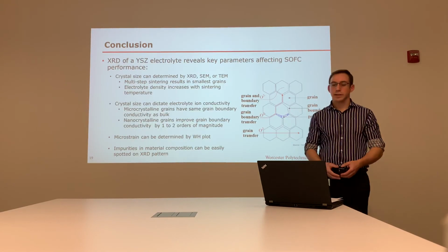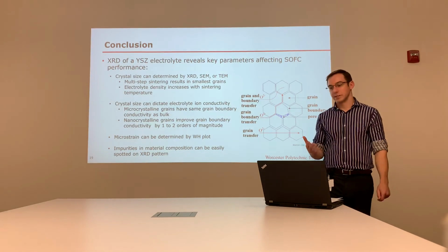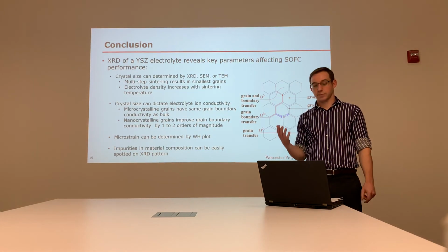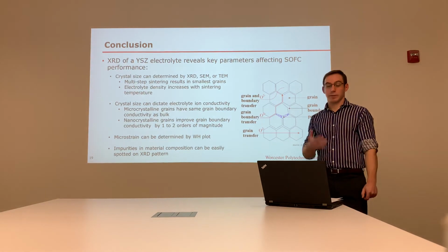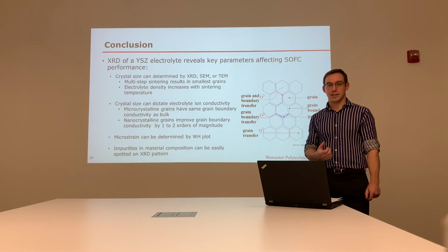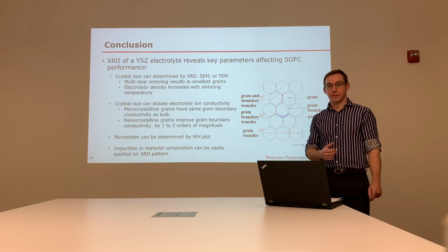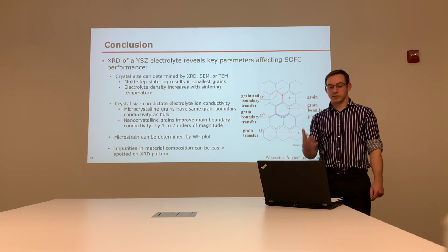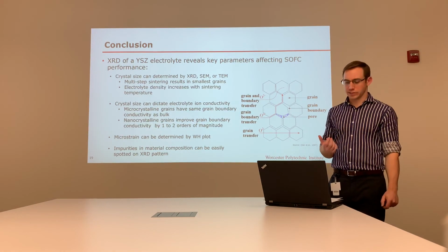So in conclusion, X-ray diffraction of a YSZ electrolyte reveals key parameters affecting the SOFC performance. And the crystal size can be determined primarily by X-ray diffraction. That's probably the best overall way to do it, but SEM or TEM images can also tell us the grain size. The multi-step sintering results in the smallest grains, and the electrolyte density increases with sintering temperature.